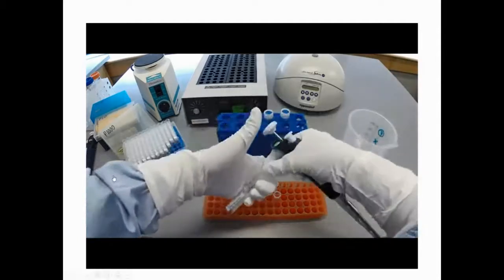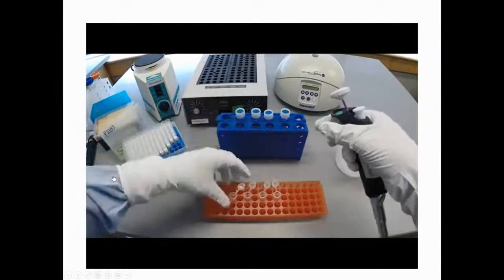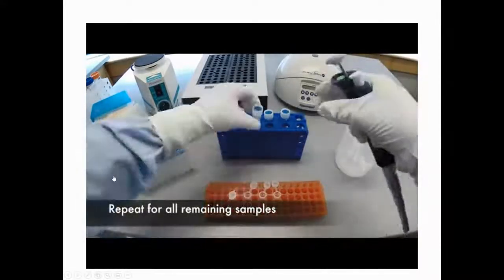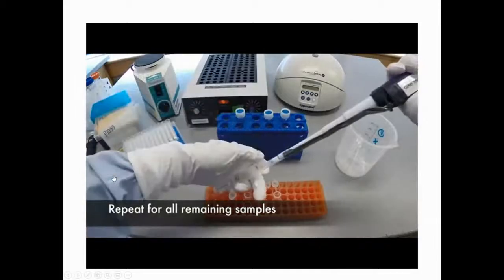Once the solution is transferred, close the spit tube lid and cap the sample. Repeat this process for all remaining samples.